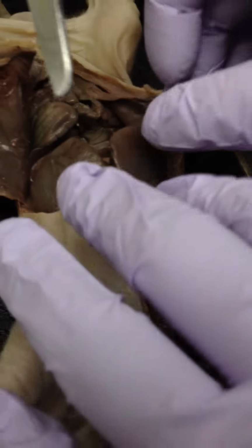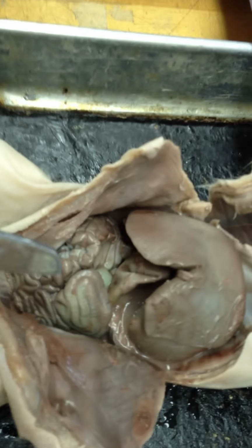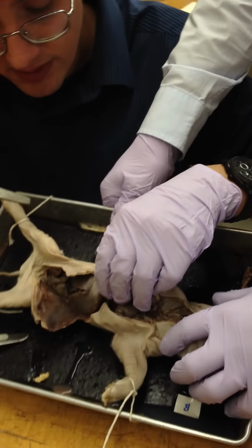One more thing that I wanted to see, Aleo, is can we see the kidneys behind there? Yeah, they're behind somewhere in the back. You gotta drain the juice out to see them. Yeah. Okay, fine. Here we go. Time to make a mess. Actually, I'm gonna have to tip it.